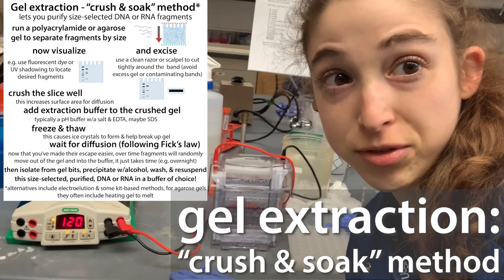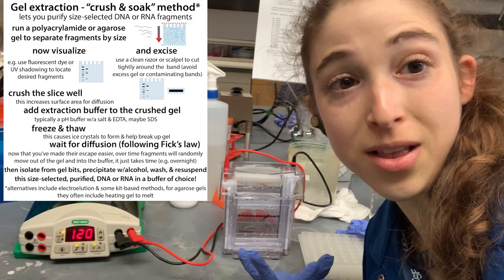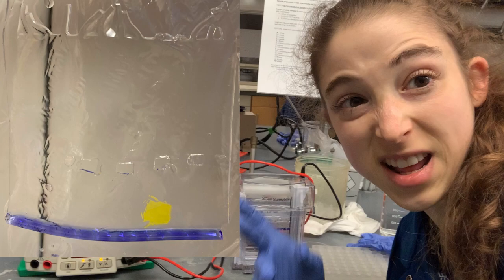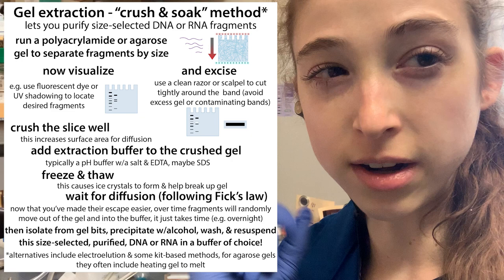Using gel electrophoresis to separate DNA pieces by size — not just to get a look at them, but as a way to purify them. So I'm actually going to extract them out of the gel after I take a look. You cut around the band, see where the bands of interest are, so it should be separated from the other stuff. Then you cut out the band, crush it up, add some buffer, freeze it, thaw it, and voila — you have purified DNA. This also works for RNA with the crush and soak method.